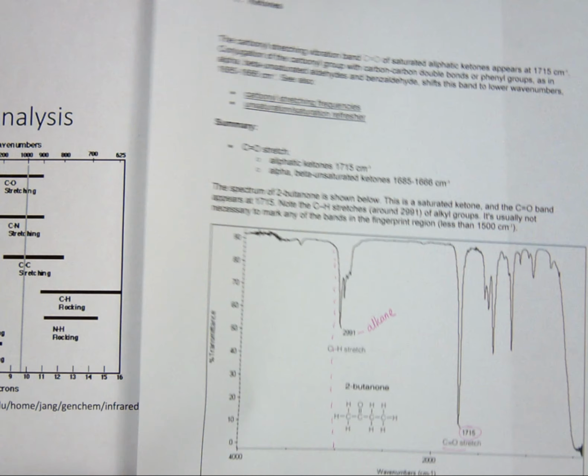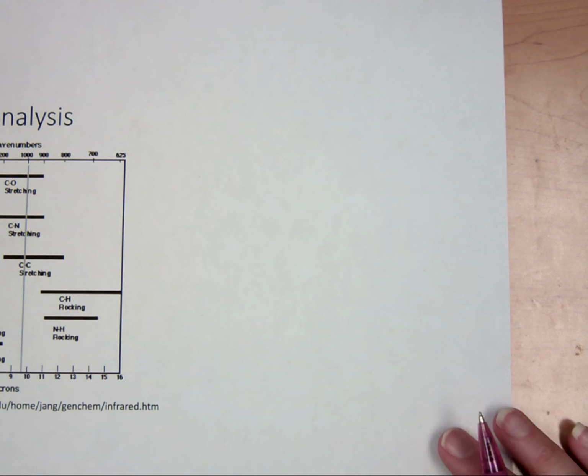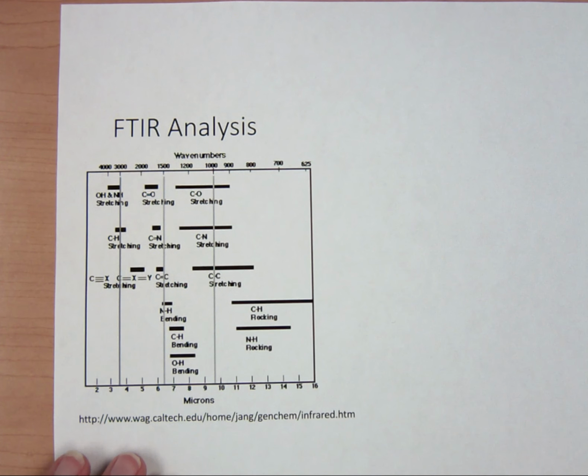Okay. So that's just a quick guide to checking out our spectra and how to annotate them, and I hope it helps you as you start working through your IR tutorial, as well as the practice homework that will ask you to specifically annotate a variety of spectra along the way.